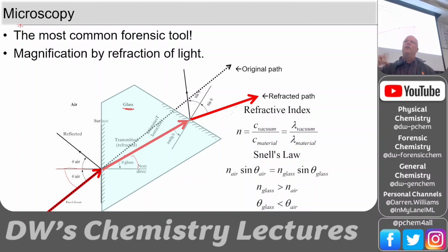Light goes through, and that oscillating electric field interacts with electrons. The electrons will oscillate with that field, and they won't absorb it unless there's a particular transition, a difference between energy levels. It's different by material, and every material will slow it down differently. Air slows it down very little. This amount that it slows light down changes the speed of the light.